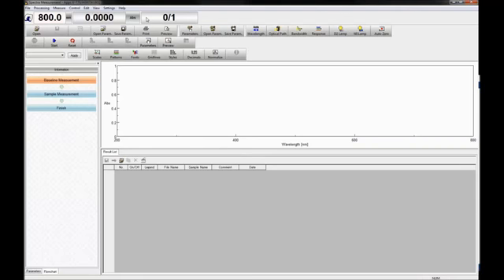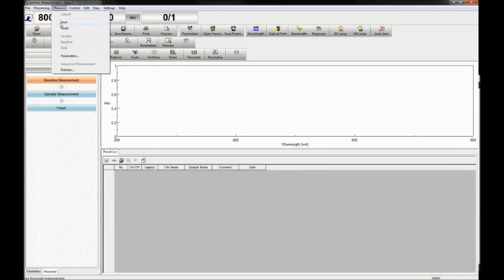If a flowchart has been selected, begin the measurement by selecting the Start icon or going to measure Start.